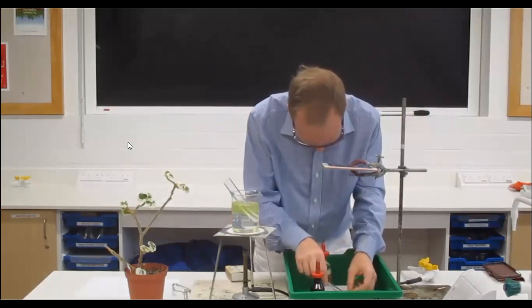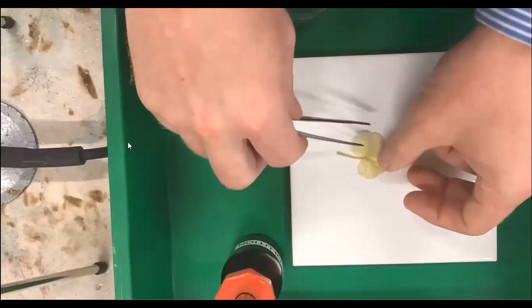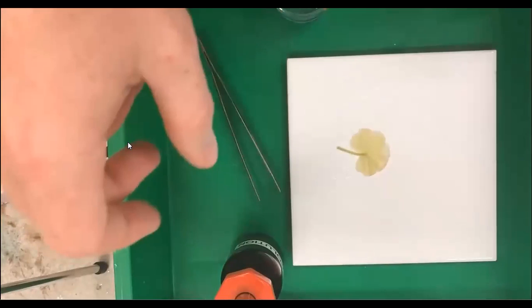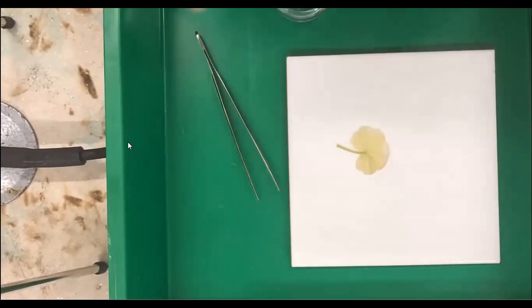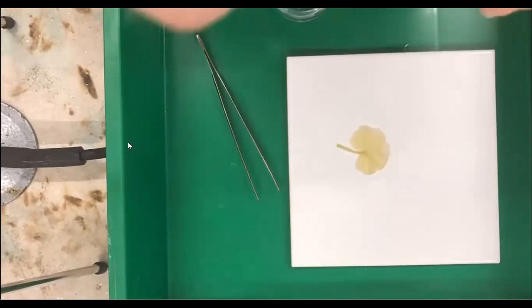Okay, let's go. And we're going to put our iodine solution in it, and we're going to drizzle our iodine solution onto it.